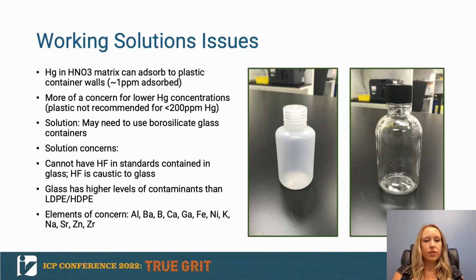Another thing that you need to consider is whether you have HF to stabilize elements in your solution. HF is caustic to glass, so if you do have to add HF to any of your solutions, then those cannot be contained in glass. So just make sure to keep that in mind when selecting your container material.